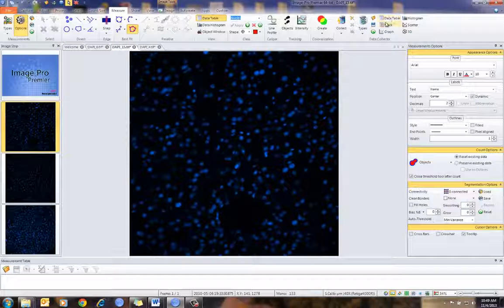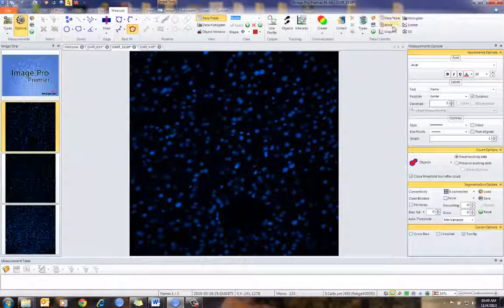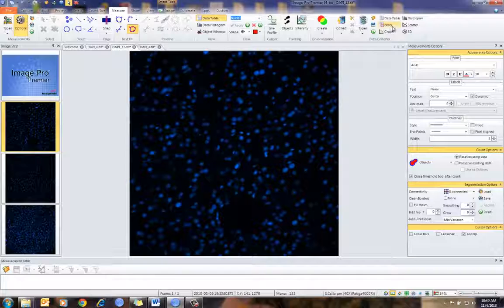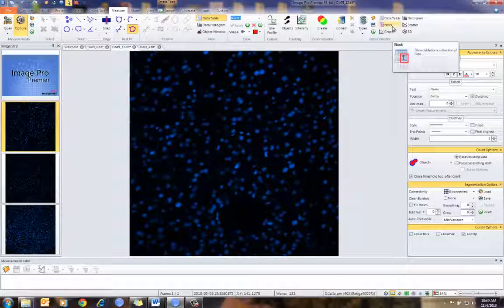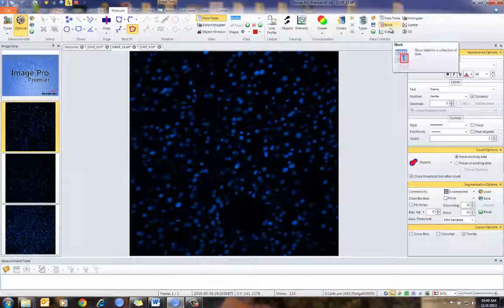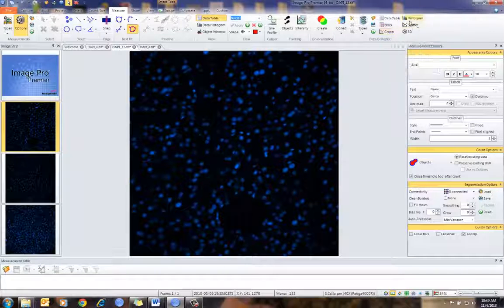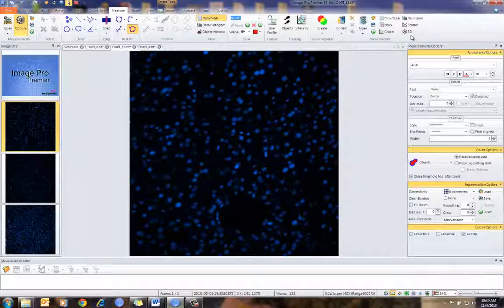We have a variety of data views here from the data table. We can look at individual block diagrams — if you're collecting data from multiple images, you can look at the individual images. We can plot the data, and we can also look at histograms, scattergrams, and 3D views.